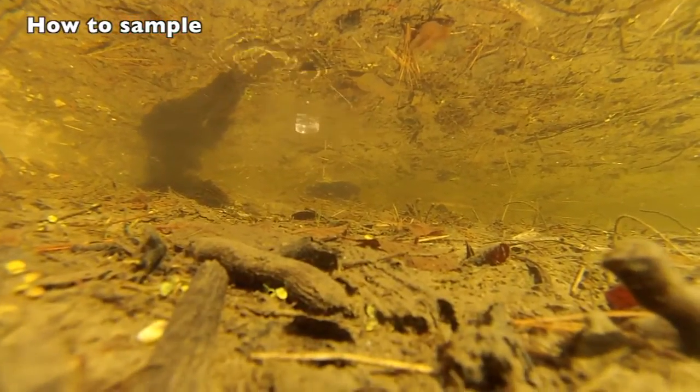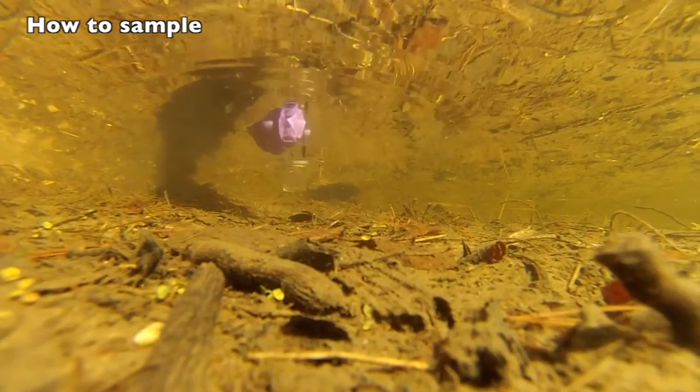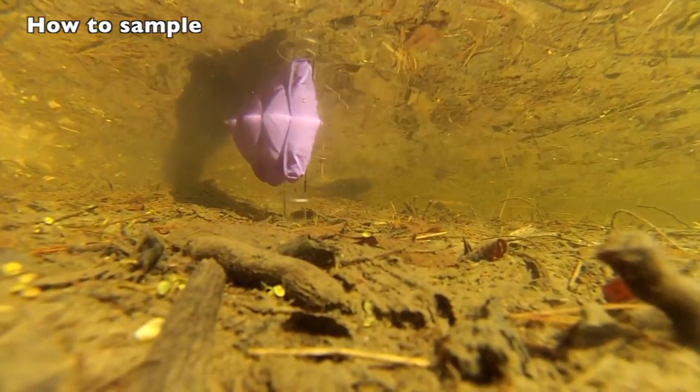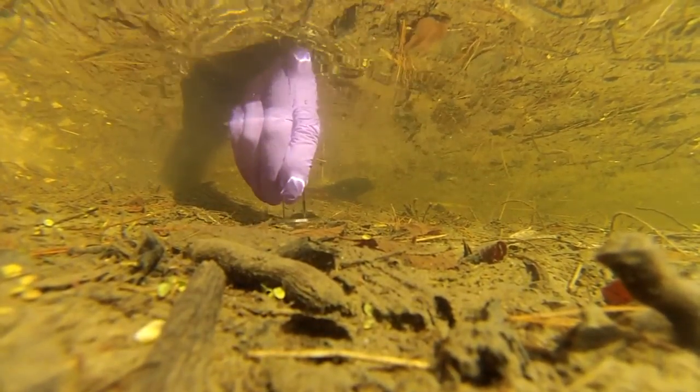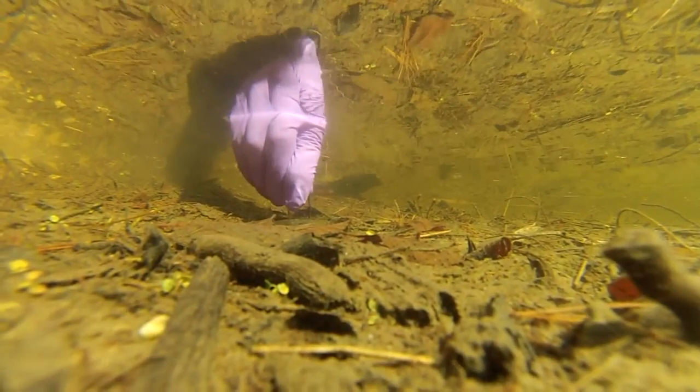Where you will be collecting the sediment, the person collecting takes one pre-cleaned sampling tube or mini-corer and presses it about two centimeters into the sediment surface at the spot you picked. Your mini-corer should have a line marking the depth to collect at two centimeters. Use the depth washer as a marker so that you do not push your corer too deep.